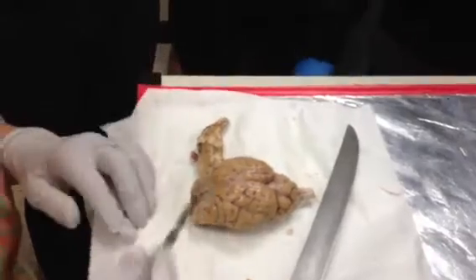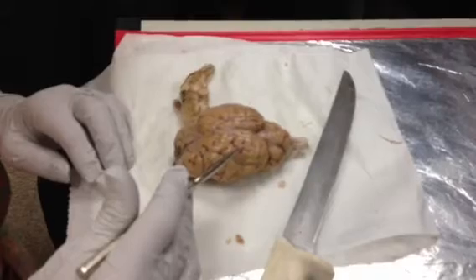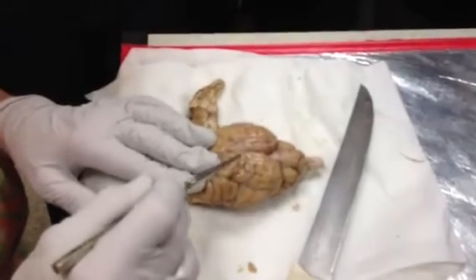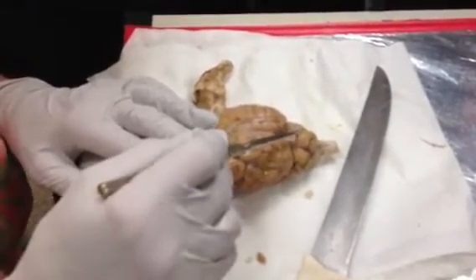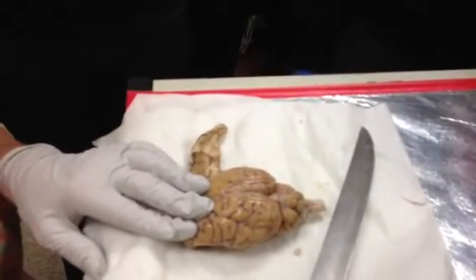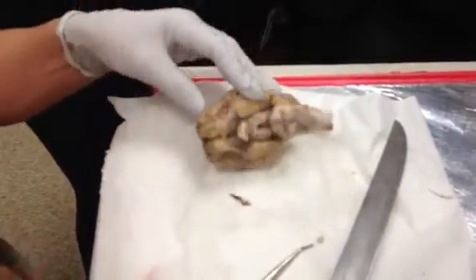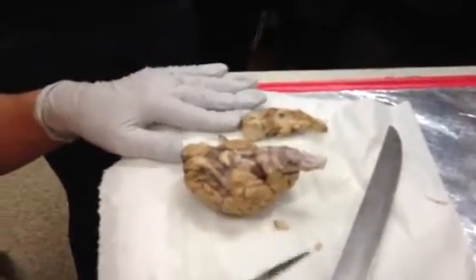Dorsal view, what we have here are the gyri, the sulci, longitudinal fissure. You will see a little bit of arachnoid on this guy. Okay? Here's our cerebellum, here's our spinal cord. Make sense? Now, what I'm going to do is I'm going to go over this first, and then I'm going to cut it.